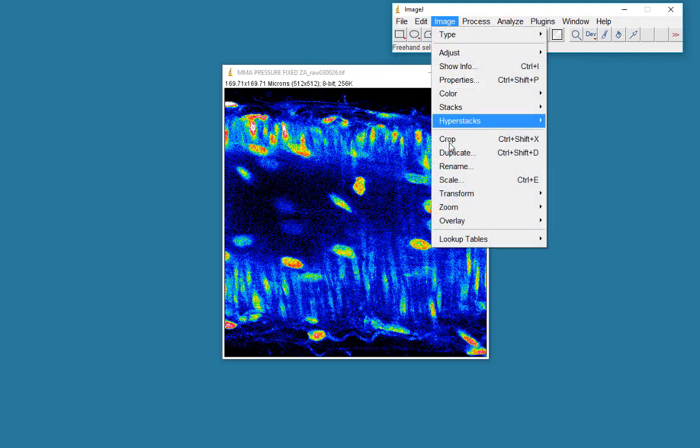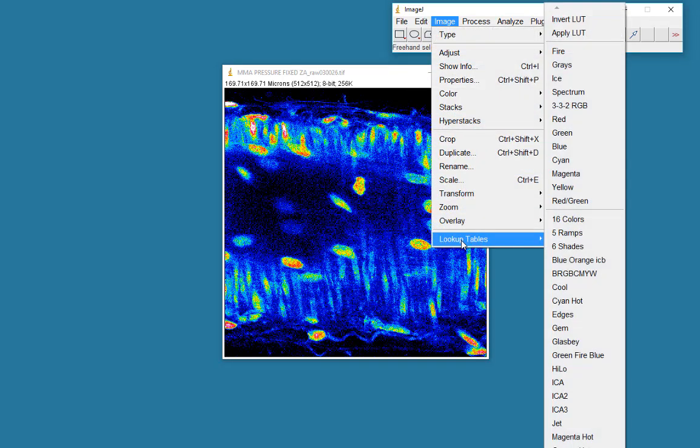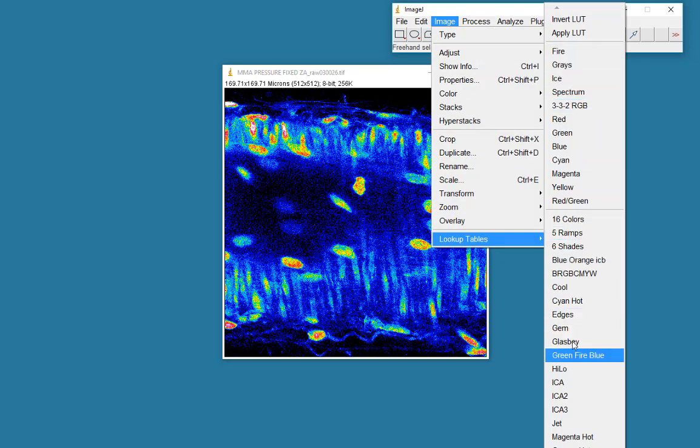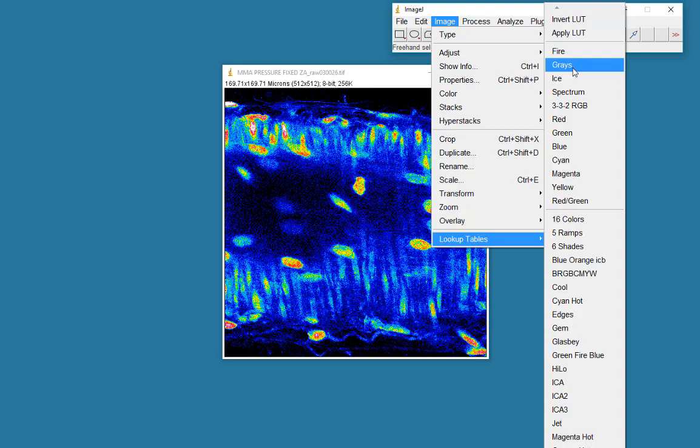But I just want to go back to greyscale for the moment. And you can see that ImageJ offers us a huge array of different lookup tables. So we'll go for a grey lookup table.